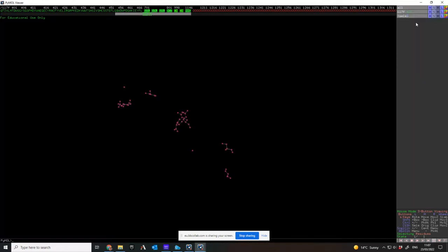Now I want to show as lines those particular things that I've highlighted, the two GOLs, the BCZ and whatever. So if I unselect these things now, you can see them as lines. I should be able to select two buttons and zoom it. Yes, I can. So I can zoom in and look at these things.